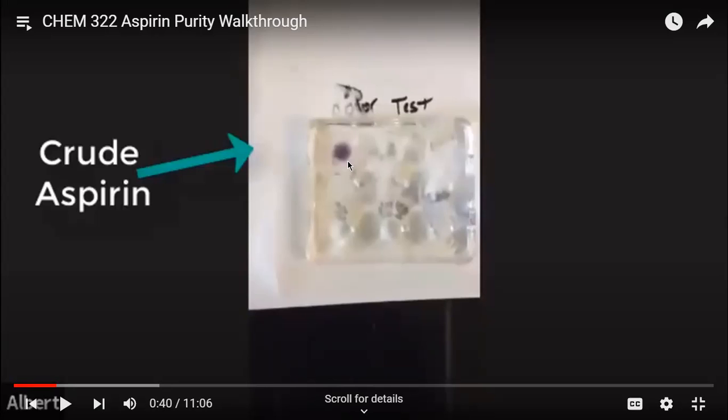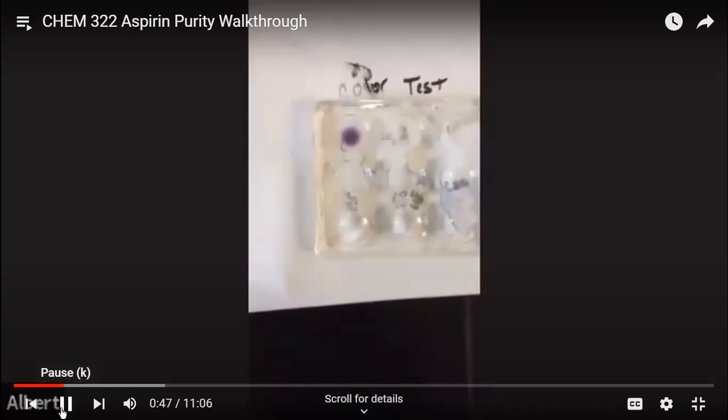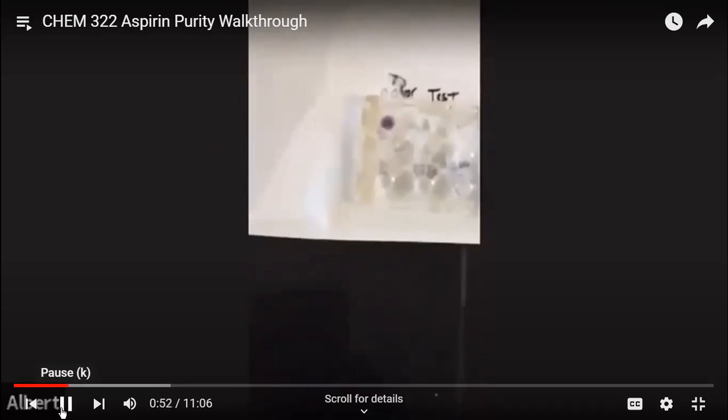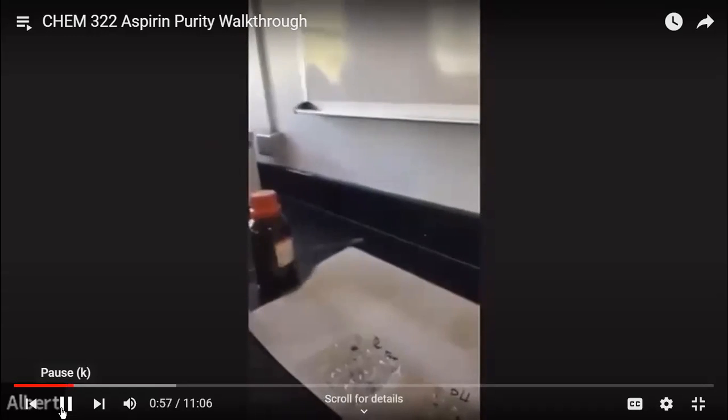So that's crude aspirin dissolved in ethanol, and you can see immediately that it's not very pure. There's a ton of salicylic acid left over, just judging from how dark the purple is. All right, let's move on. See how purple it is? It's full of crap. That's what you don't want. So now we know what we don't want to see. So I'm going to add this same iron chloride, a drop, to pure salicylic acid to see what happens there. Hopefully you can still see that.